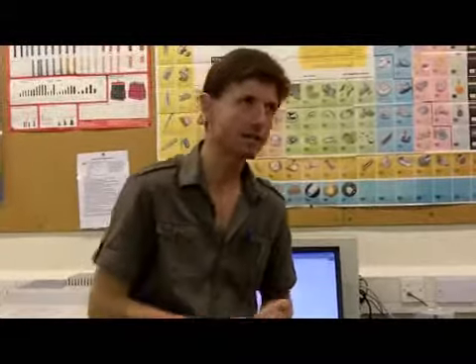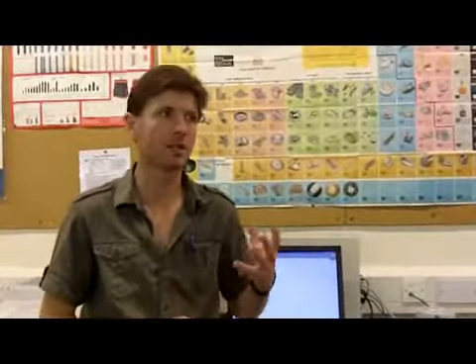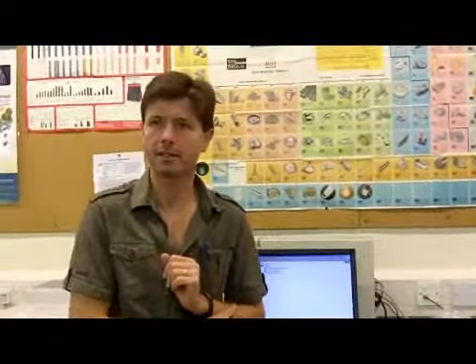Okay, so we're using two techniques to study it. The first technique is X-ray photoelectron spectroscopy, and you will have met that a little bit, but I'll just remind you of the basics, because I don't think you've done it in as much depth as I would like you to have done. You may have to look that up on the web or in past lecture notes. I think Adam talked to you a bit about it in the CH2210.